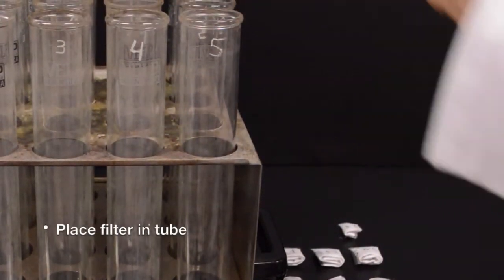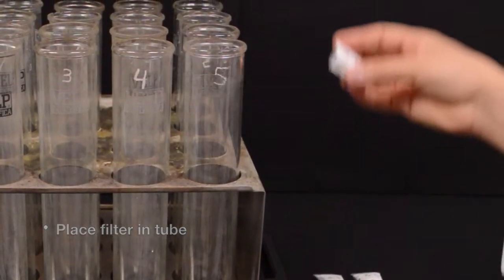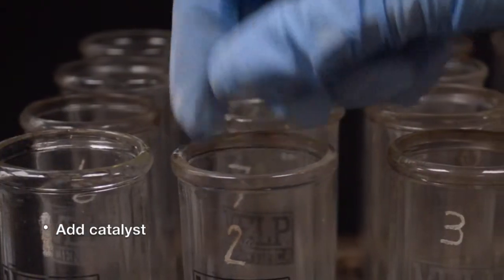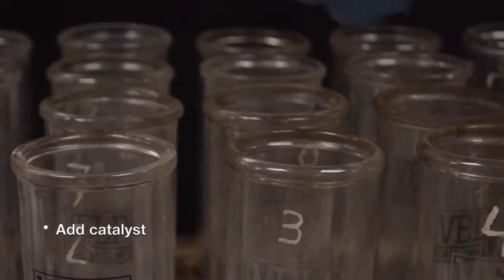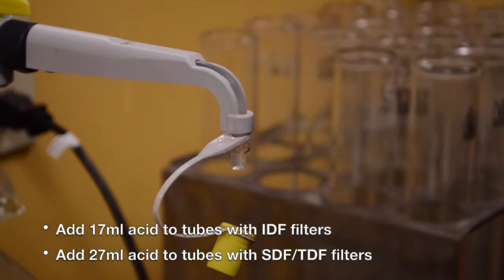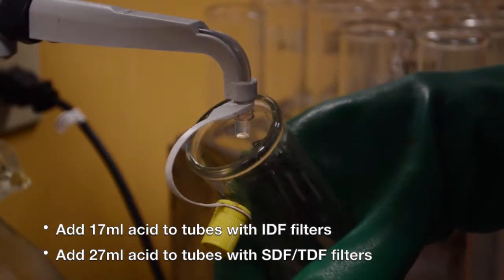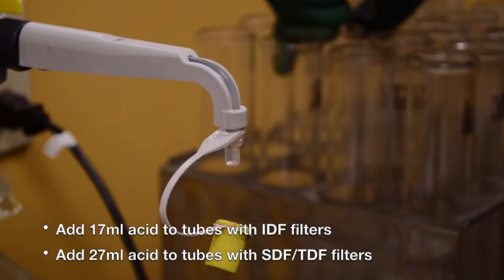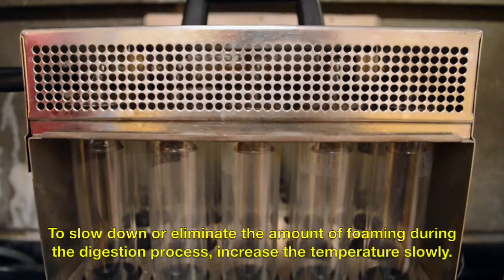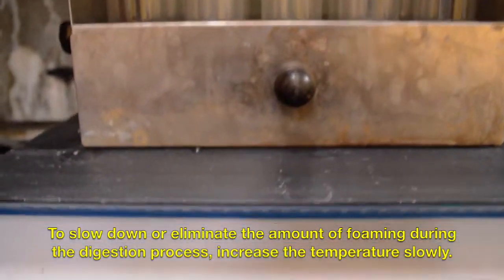Place one labeled filter in each Kjeldahl tube. Add the appropriate amount of catalyst to each tube. Add 17 ml of acid to each tube that contains an IDF bag and 27 ml of acid to each tube that contains an SDF bag. To slow down or eliminate the amount of foaming during the digestion process, increase the temperature slowly.